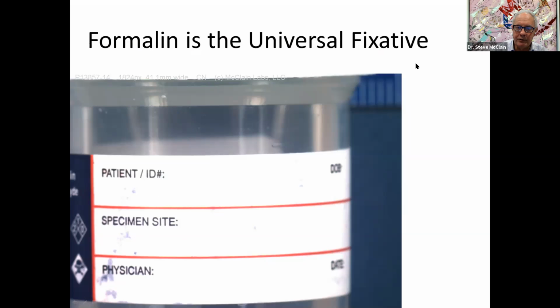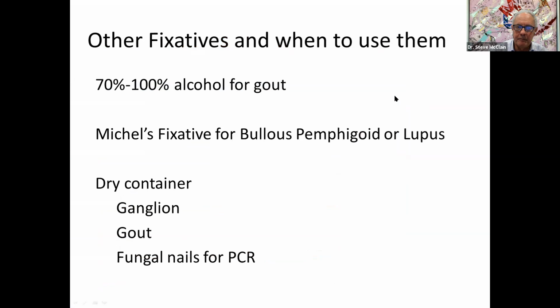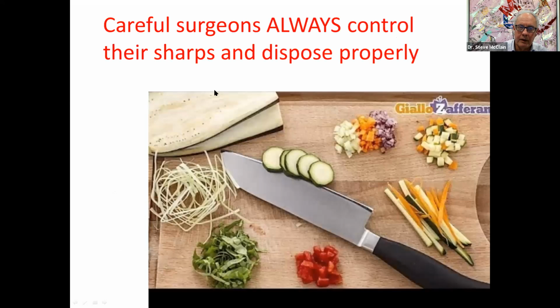Formalin is the universal fixative. Other fixatives, you can use 70 to 100% alcohol for gout. Michel's fixative is used for DIF studies, direct immunofluorescence, for bullous pemphigoid or lupus. Fortunately, these are not very common in the foot. A dry container works for fungal nails, for PCR, or for gout, or for ganglion, any one of those.